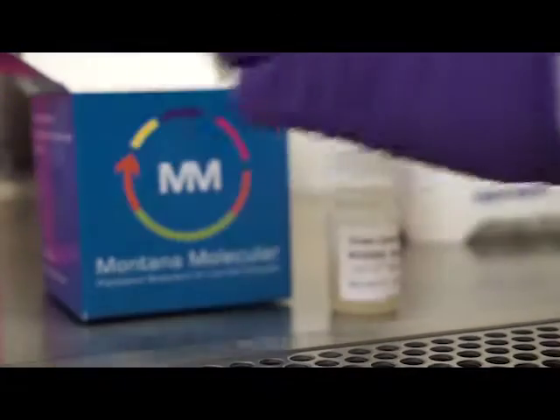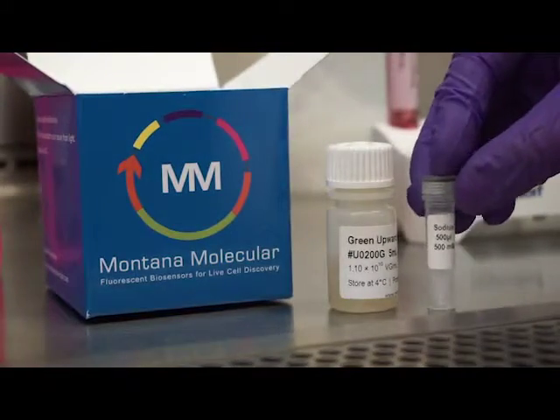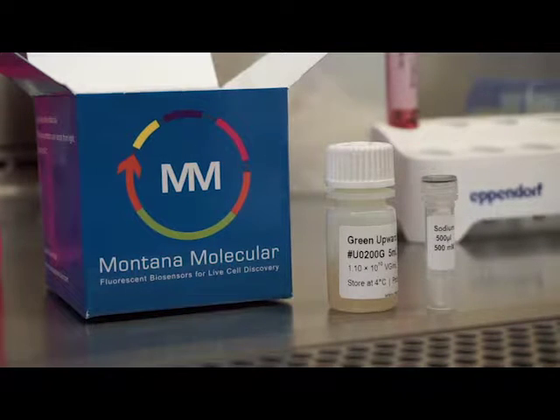HDAC inhibitors prevent gene silencing and result in higher and prolonged expression. In addition to sodium butyrate, we recommend valproic acid and trichostatin A. The optimal HDAC inhibitor depends on the cell type being used.